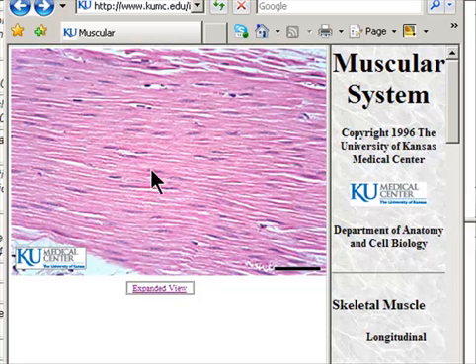So look at this. You can see these spindle-shaped cells with these nuclei. It kind of looks like fish swimming in a stream. So, that's one way I look at it for you to identify. So you can see how it is very different from, so this looks very similar to the image you have, but it's very different from dense connective tissue.